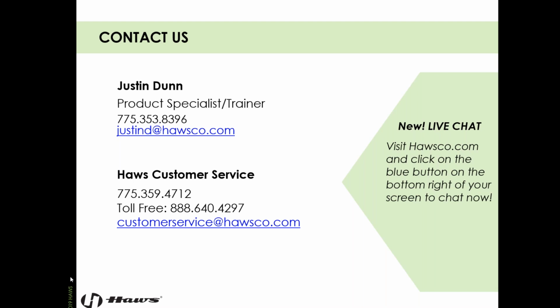Third question, how do you provide tempered water for portable eye wash or shower stations? For portable equipment, there's a lot of situations where you have a remote building or a site that you just can't plumb water to. And sometimes those are outside. And if you need to freeze protect it, options are growing rapidly nowadays.